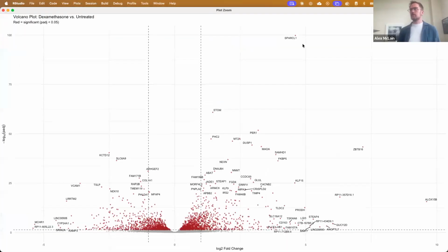And this is the first gene that we looked at the data of. Log2 fold change is about 4. The adjusted p-value is times 10 to the -100, some ridiculously small value. Here's the other one we inspected. This is the one with the largest log2 fold change, but we can see some others that would certainly be of interest, and some of those down here.